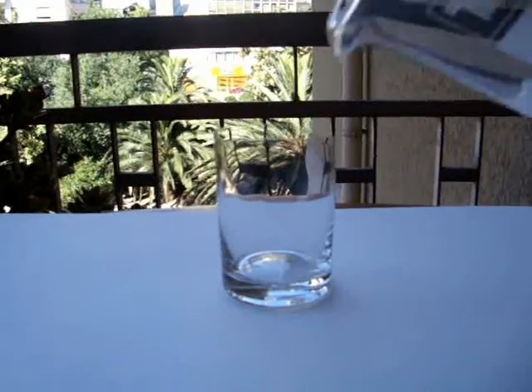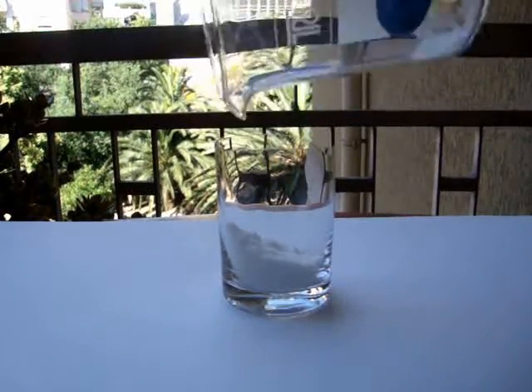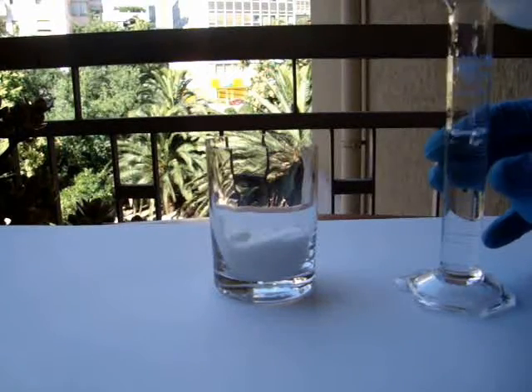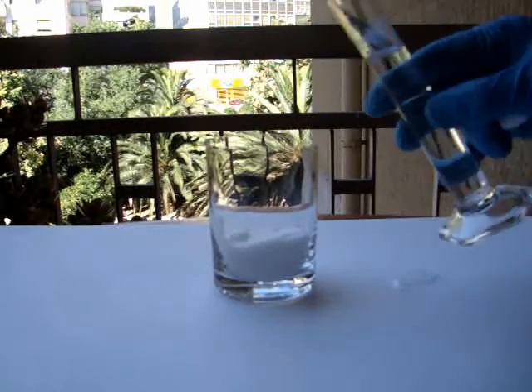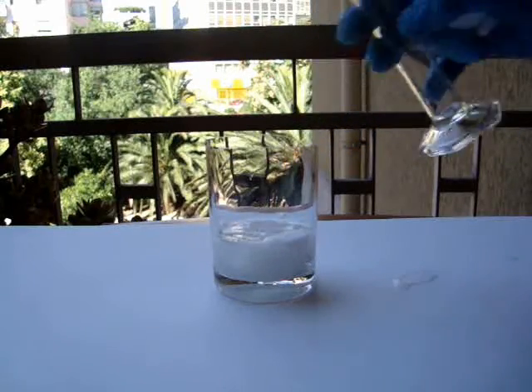With a spatula, put about 40 grams of a nitrate salt. I am using potassium nitrate, but you can also use another nitrate salt, like ammonium nitrate. Put the salt in a glass container, then add 25 mL of water and try to dissolve as much as you can.